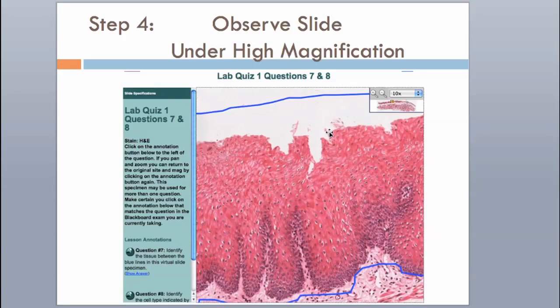Dead skin cells are characterized by a layer of flattened looking cells that have the appearance of having no nuclei, and these cells may be faint in color as they really don't take stain very well. The reason for the lack of staining nuclei is that the cells are not living, and therefore they do not have the molecular metabolic characteristics that would cause them to be attracted to a stain. So the lack of a layer of dead skin cells for this slide indicates that this epithelium lines something found inside the body. Additionally, we can also see the shape of the cells at the free surface as being squamous.